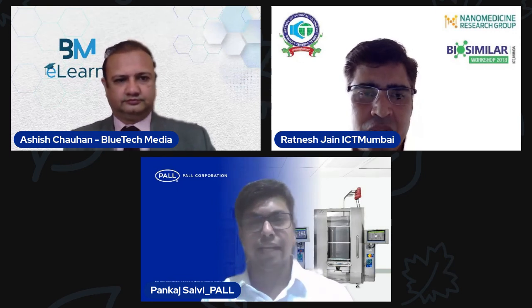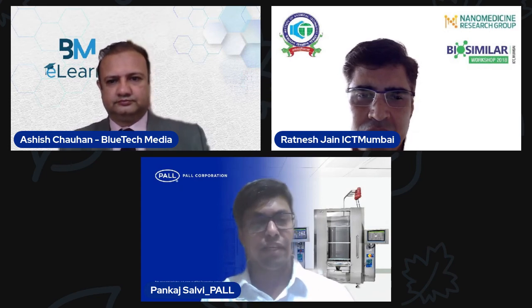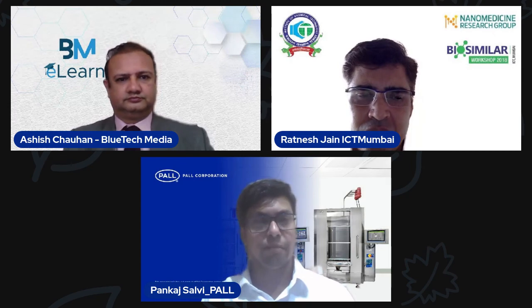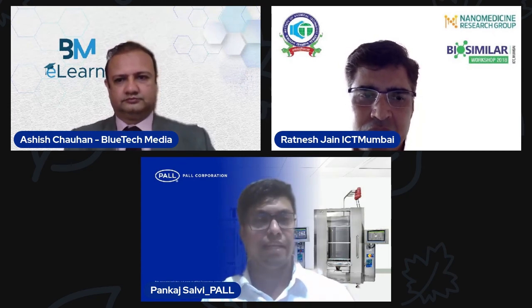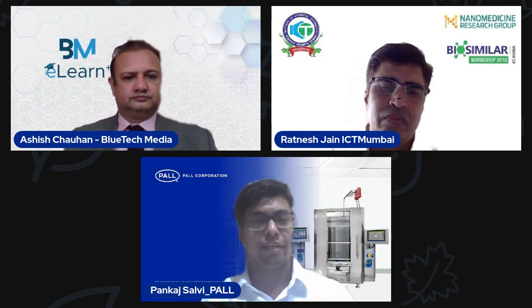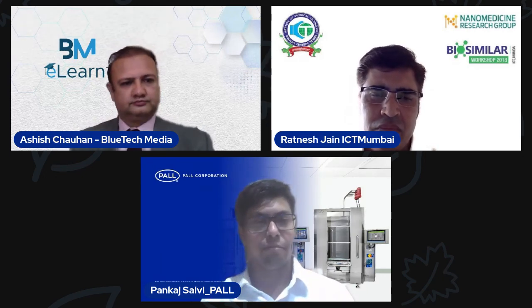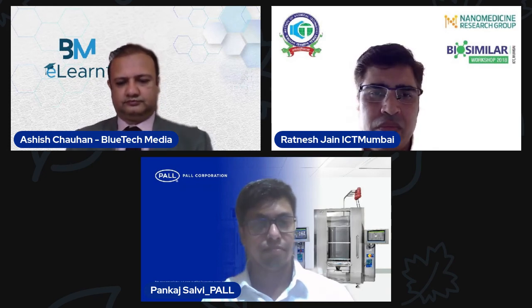And the challenges, I would say, as you increase the scale, the chances of leakages would increase essentially, because of the hydrostatic pressure building in. So leakages would be a primary concern in that case. And again, it depends on the technology, vendor to vendor. Meeting the heating requirements and gassing requirements may also be a challenge in single use.